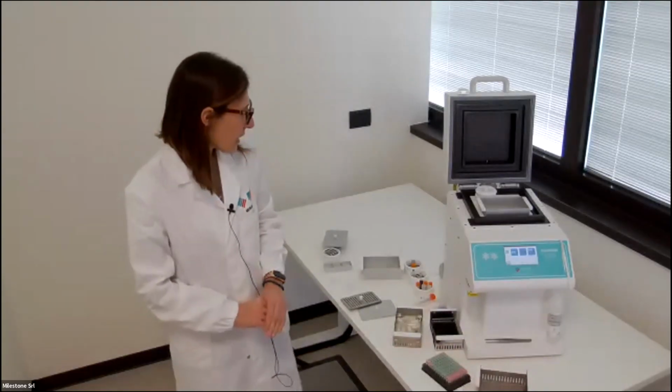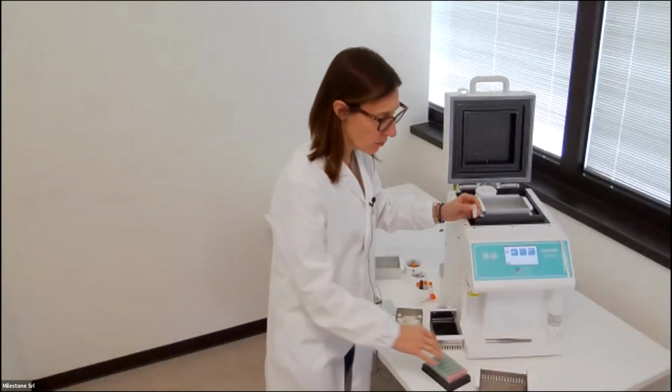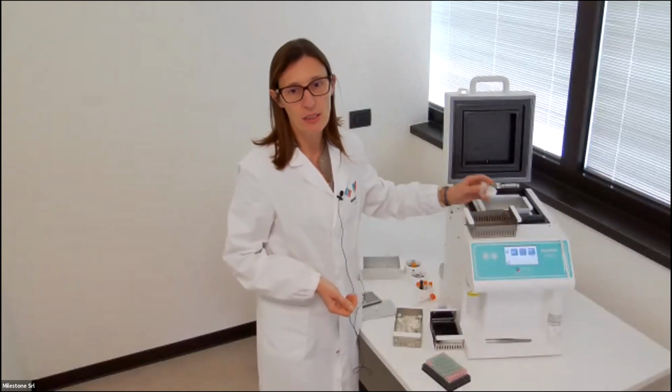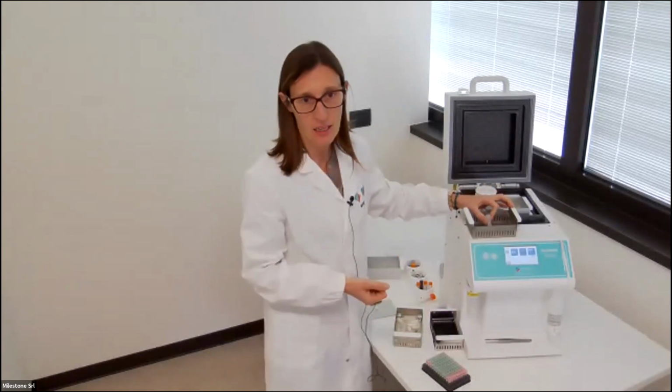Is it compatible with any rack of cryotubes with the same size, or does it require specific tubes and racks? For the freezing in cryotubes, in cryovials, it's possible to freeze all the vials that you want. As you can see, with this rack, you can put the size of the tube that you want and the type of the tube that you want. The important thing is that it's well closed because it is immersed in ethanol.